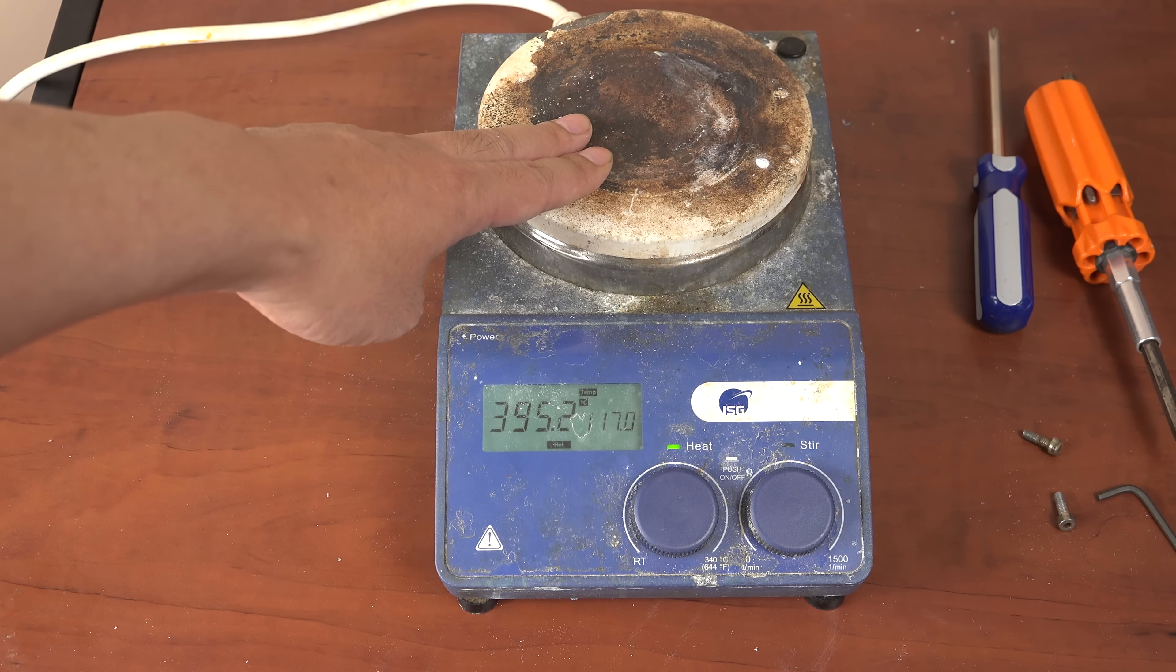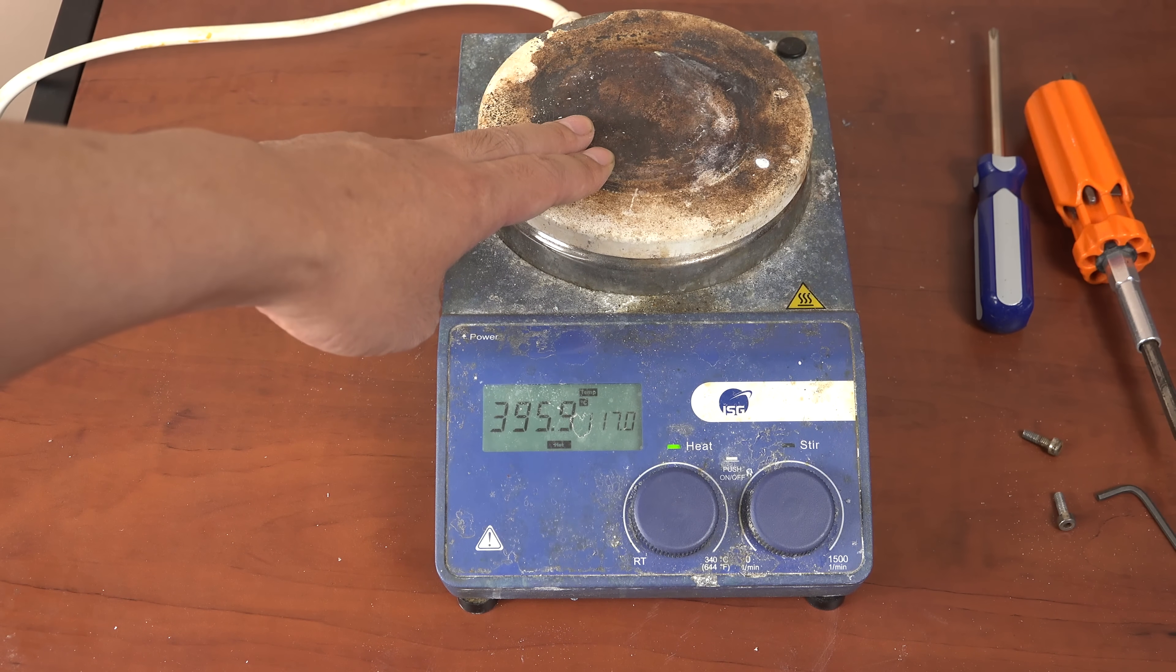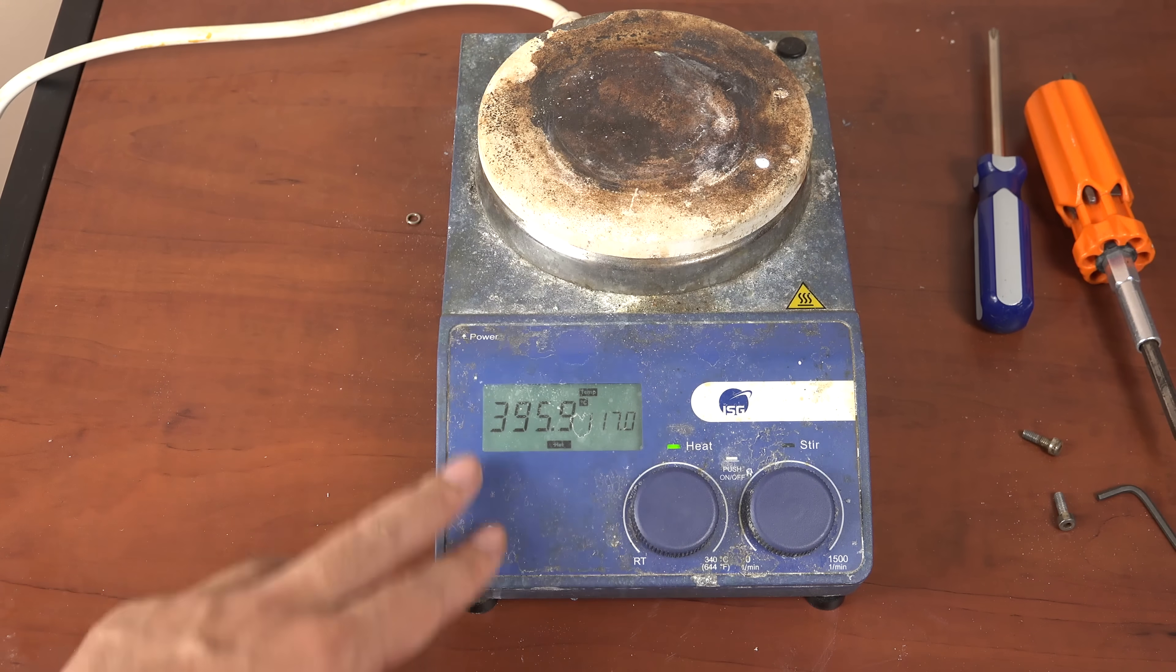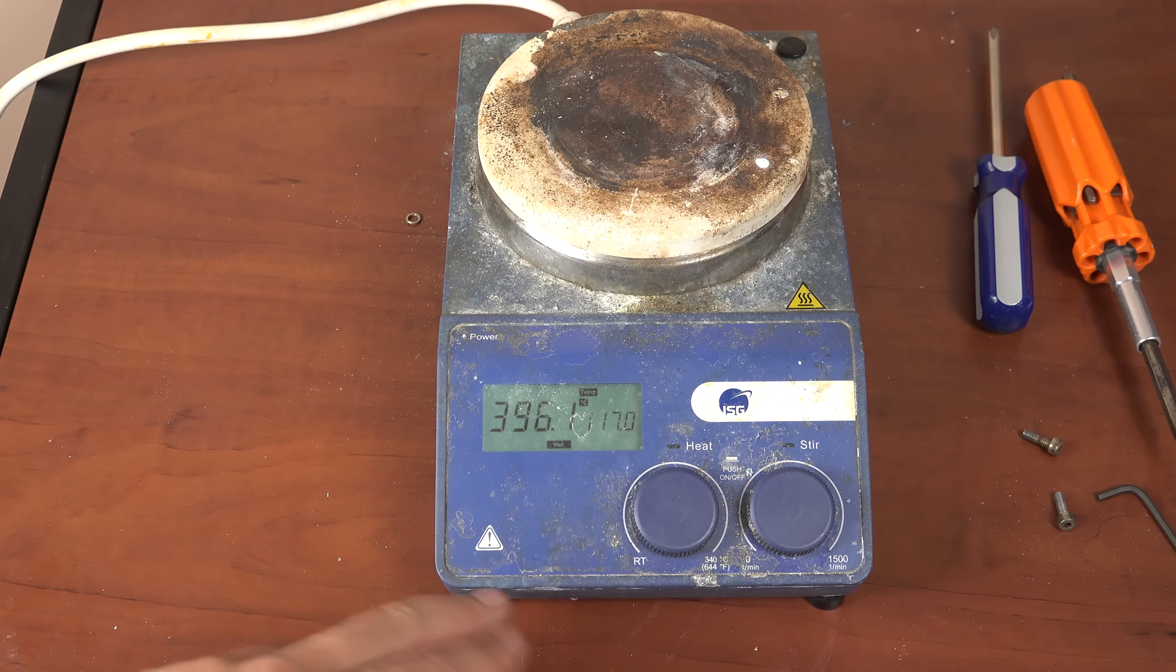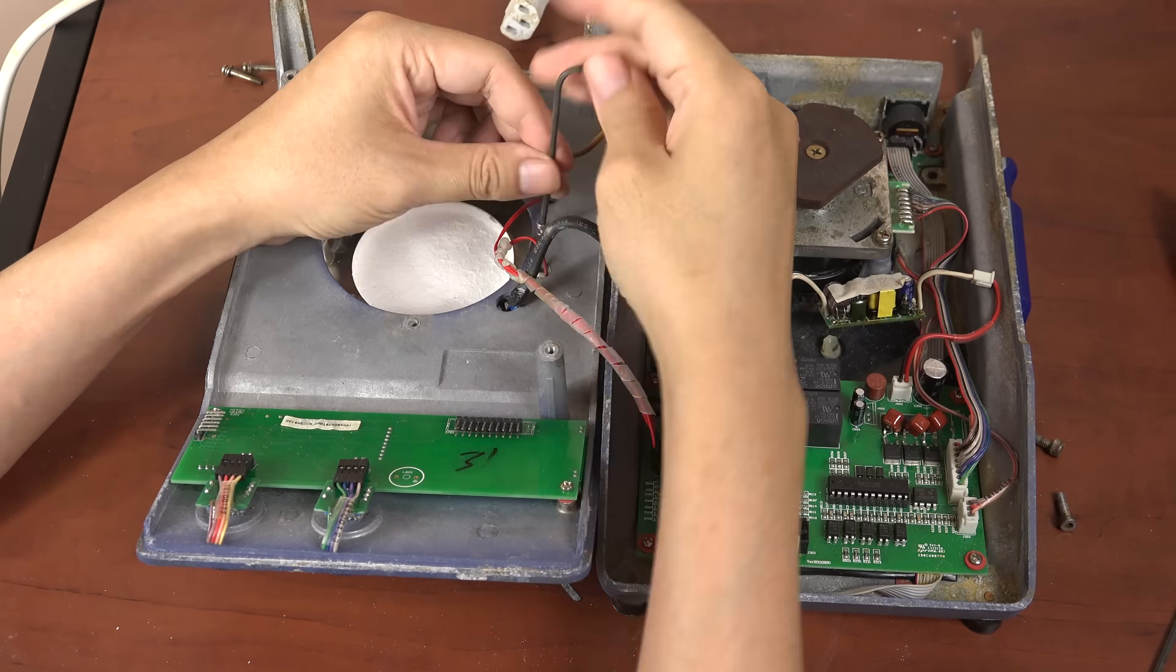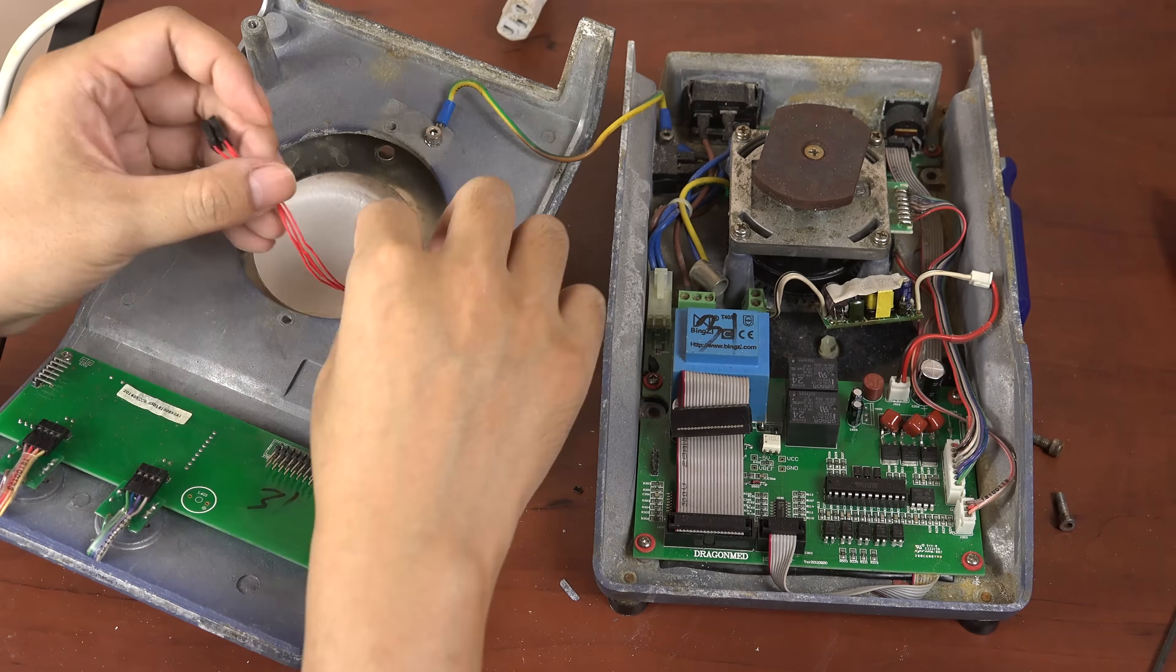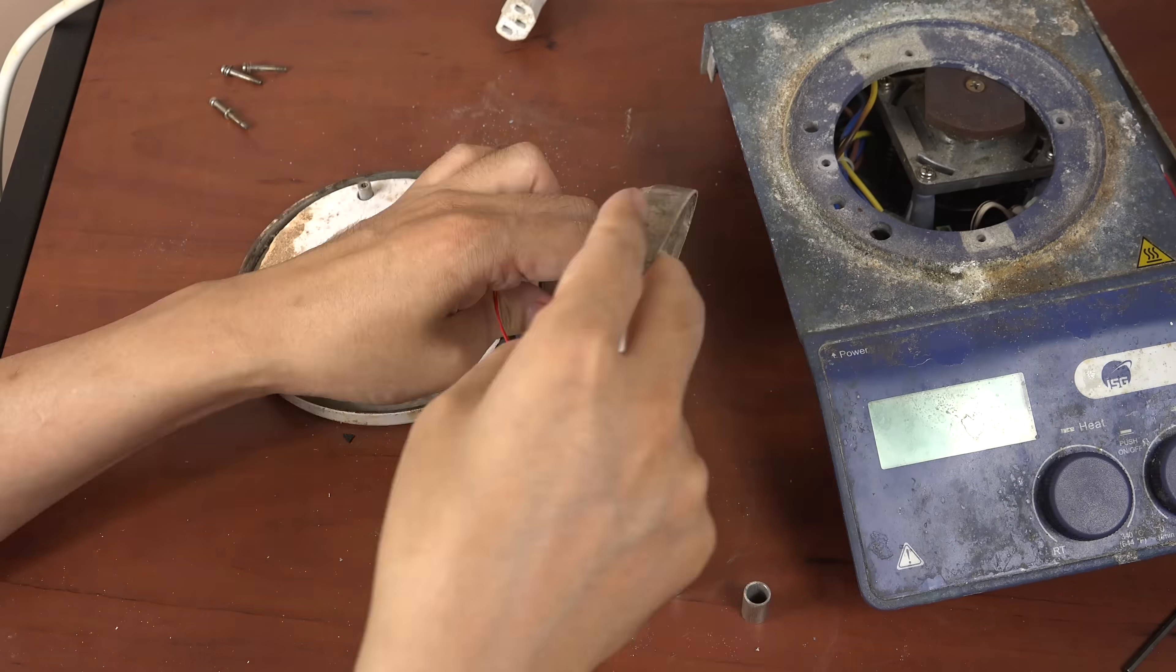The main problem is that the hot plate uses a feedback system for temperature control, so if it believes it's too hot it won't turn on the heating element. This is different from other hot plates in that they will apply power regardless of temperature. While having a feedback loop is good for safety, it means we have to fix the sensor. So let me open it up and see if we can find it.